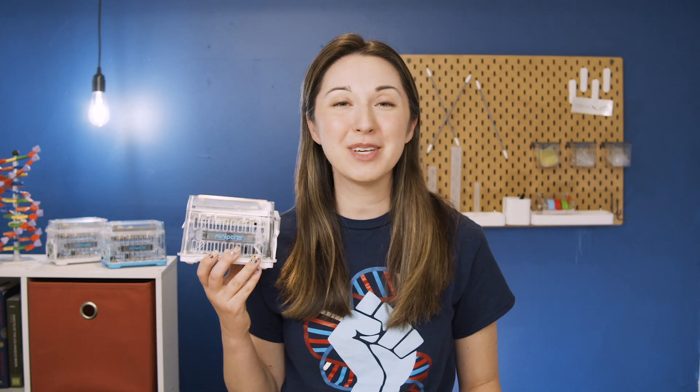I'm Dr. Alex Danis with Mini-PCR Bio, and I'm going to introduce you to the Mini-PCR thermal cyclers.